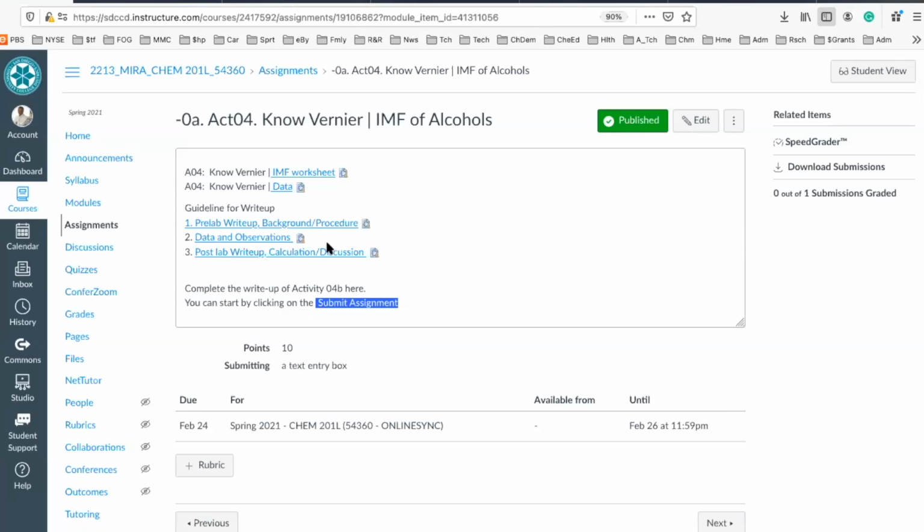And then compiling those results and processing the data, doing the calculations, making sure that you are addressing the objective of the experiment, and then compiling the table of results, okay? From the table of results, you're able to pull out the significance of that experiment and then write a discussion on that, and then answer any post-lab questions. So hopefully you've got that from General Chemistry 1, okay?